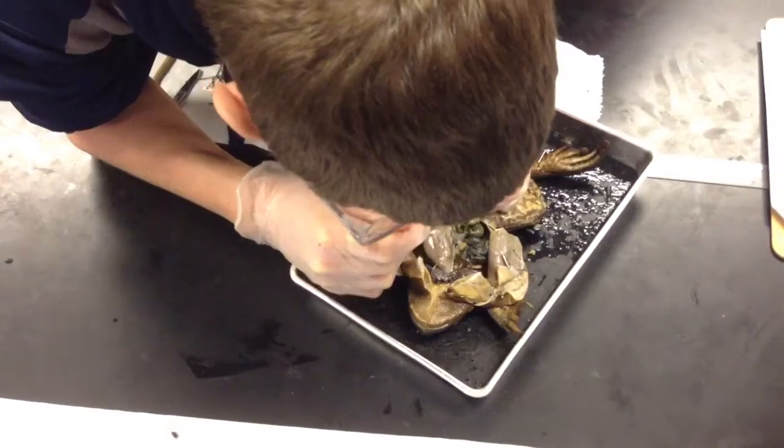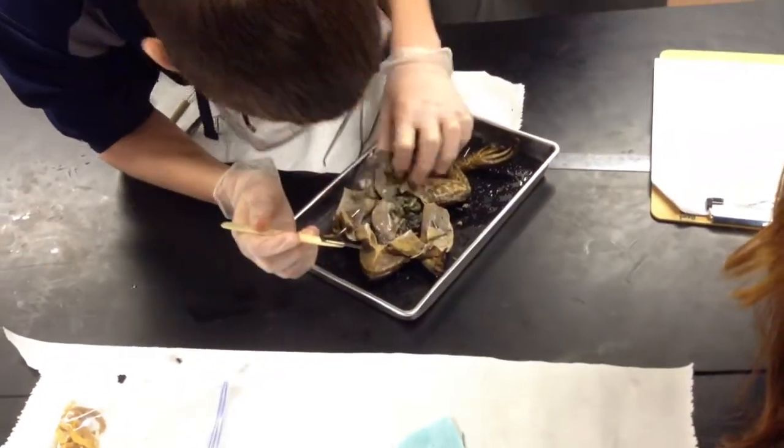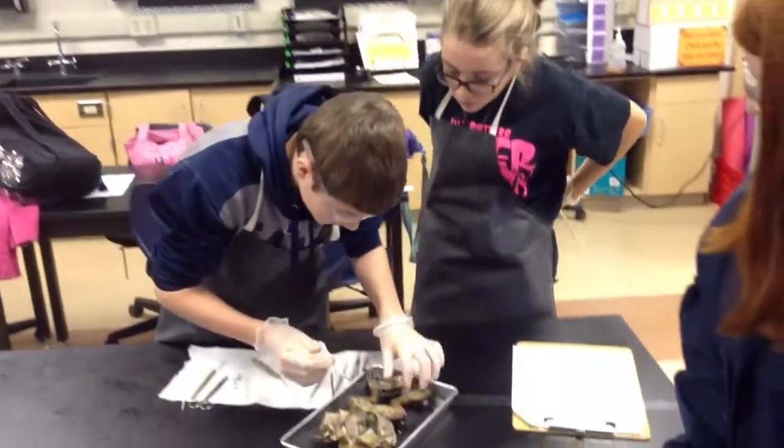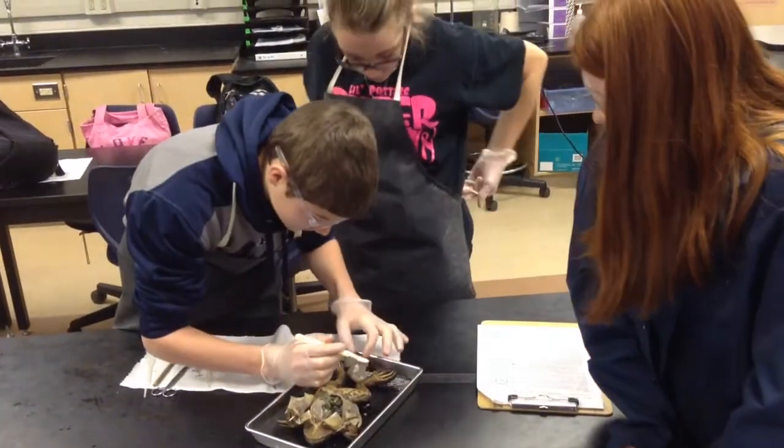Okay, you see the three lobes? And is the gallbladder still attached? Yeah. You can cut it open if you want to. Just put it on the tray and cut it open. Put it on the tray though. Just look and see what you see on the inside.